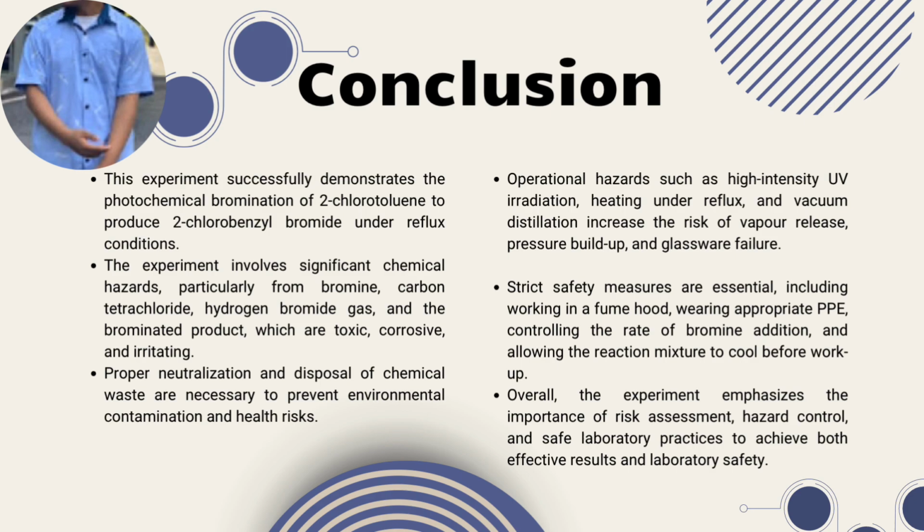Furthermore, operational hazards such as high-intensity UV irradiation, heating under reflux, and vacuum distillation increase the risk of vapor release, pressure buildup, and glassware failure. Strict safety measures are essential, including working in a fume hood, wearing appropriate PPE, controlling the rate of bromine addition, and allowing the reaction mixture to cool before work-up.